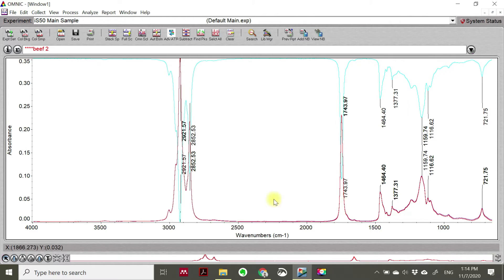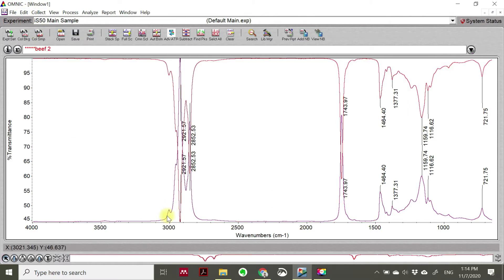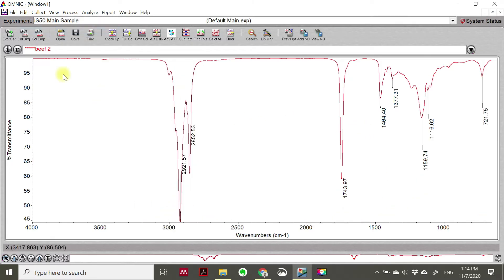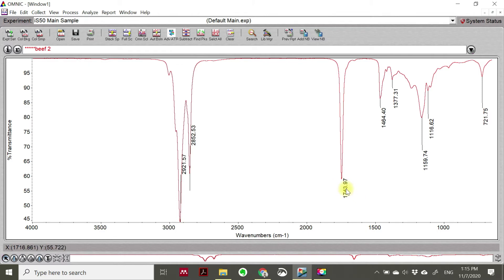So this is the final result. You can see on the name of your sample there are stars - the number of stars indicates the number of processing steps applied to your sample analysis. We want to see all the peaks from the spectrum identified. You can see here 1743.97 wavenumber - for this peak it characterizes a functional group or fingerprinting group.